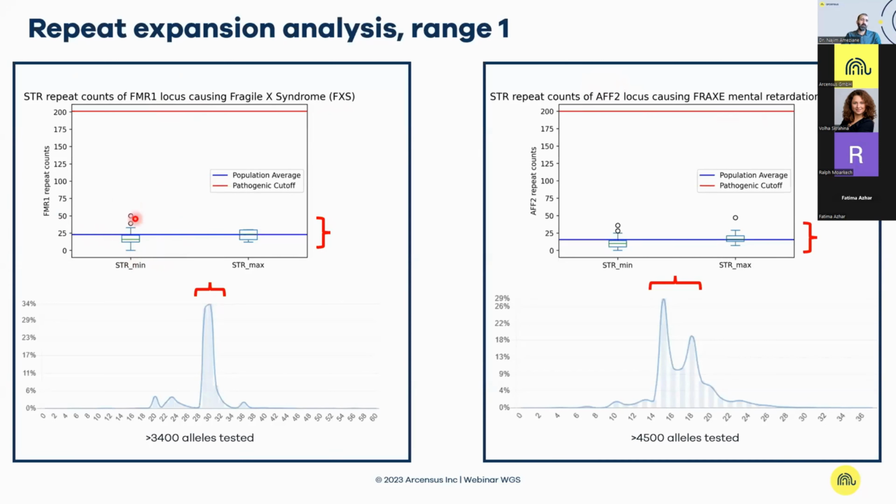And you see that there is some range difference within all these 480 samples. Nevertheless, it is a nice and narrow range, which is also comparable when looking at the normal distribution of the population that has data consisting of over 3,400 alleles.